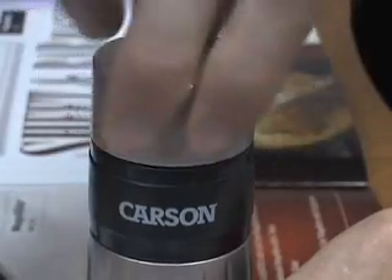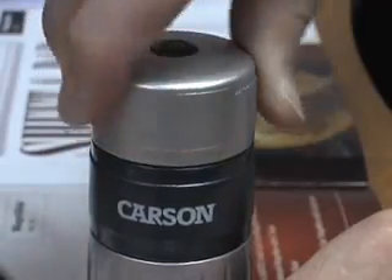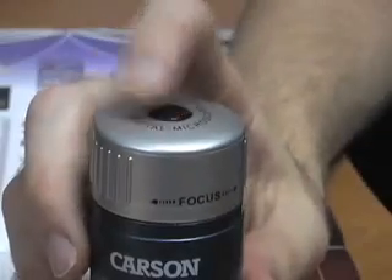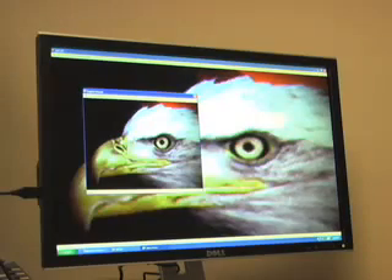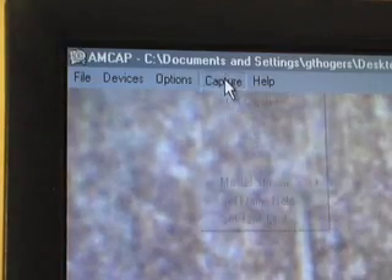To focus, turn this ring left to right until you get a clear image. To capture pictures, click the top shutter button and the image will pop up in the new screen. Capturing video is just a click away.